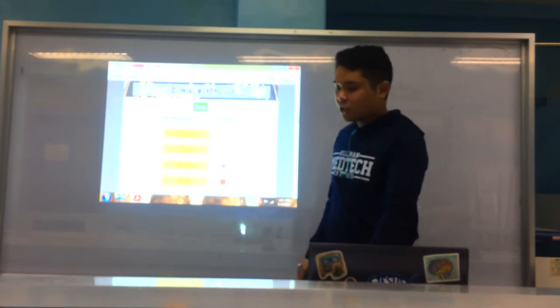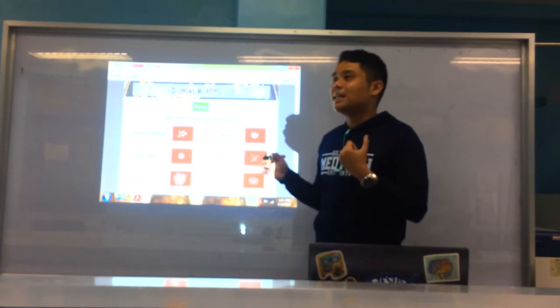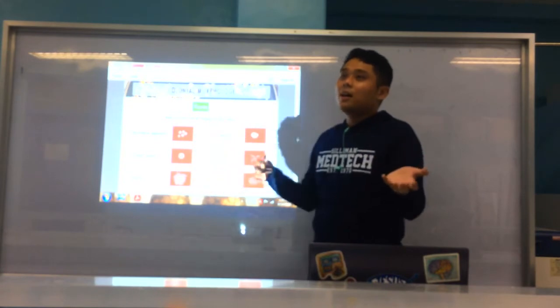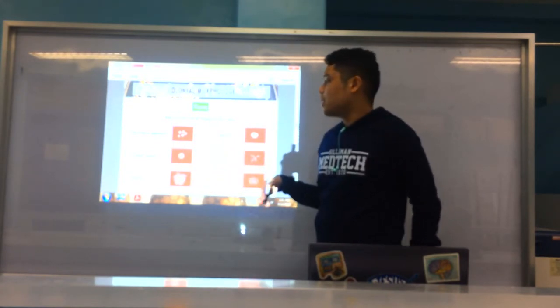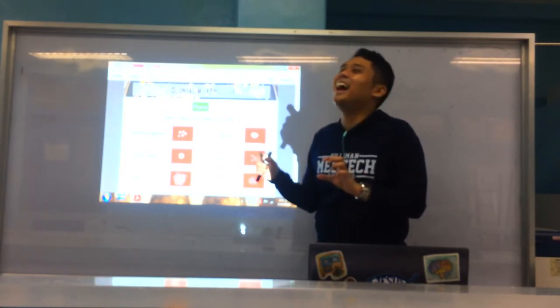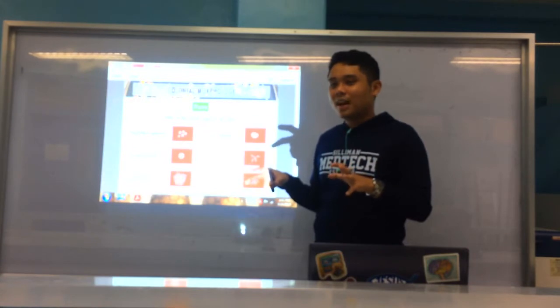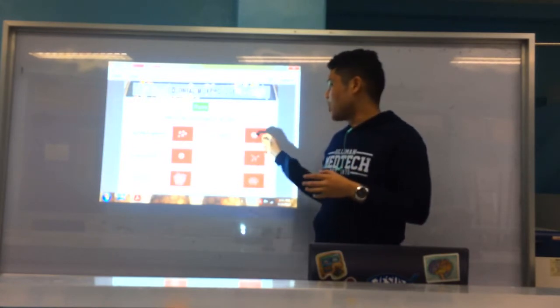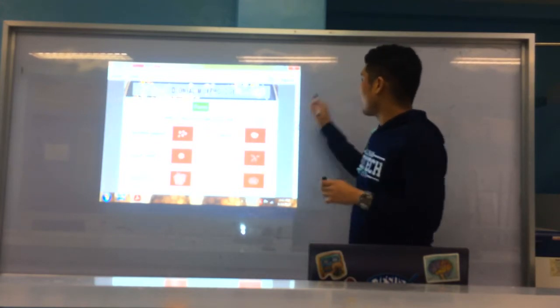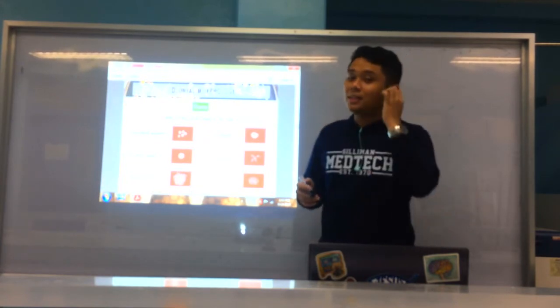Okay? Alright. After size, we now go to form. Okay? So, the overall shape of the colony, its appearance. Is it punctiform, meaning pinpoint, like S. pyogenes usually, or other gram-positive cocci? Is it circular, round? Filamentous, like hairs, or with filaments outside of the colony itself. You have irregular, it's not complete. Rhizoid, like roots, and curled. So it depends again on the bacteria that grows.